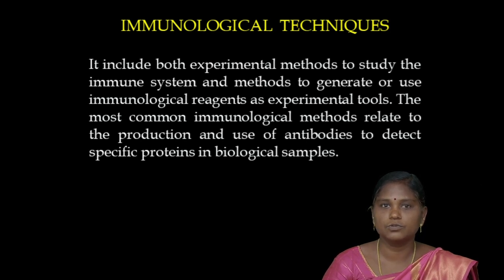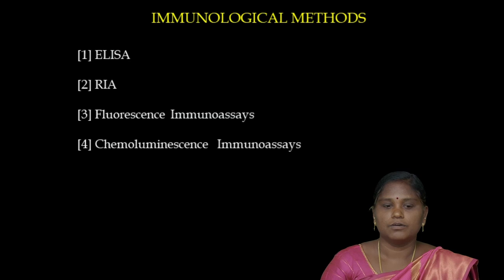samples. Here you should know what these proteins in biological samples are. It means the antigen. What are the specific antigens present in the biological samples that will be detected by these immunological techniques? Then we should know what the recent immunological methods are.